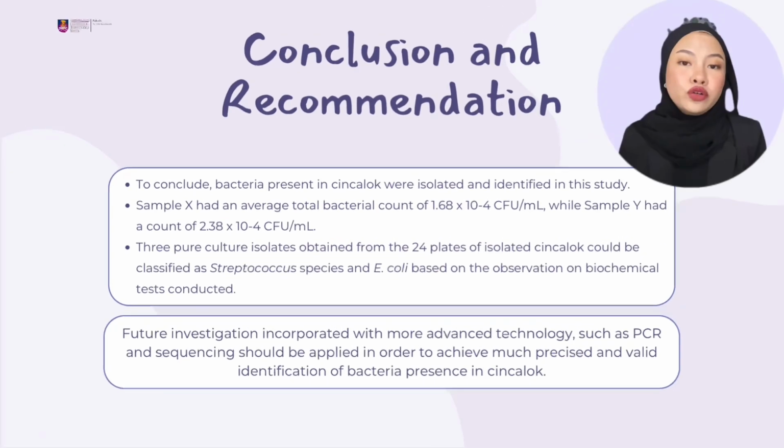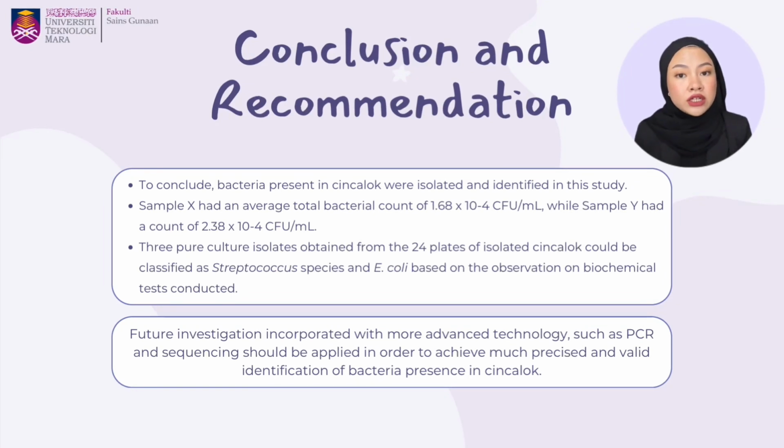To conclude, bacteria present in the Cincalok were isolated and identified in this study. Sample X had an average total bacteria count of 1.68 times 10^4 CFU per mL, while sample Y had a count of 2.38 times 10^4 CFU per mL. 3 pure culture isolates could be classified as Streptococcus species and E. coli based on the biochemical test observation. Hence, this study has successfully achieved all of its objectives.